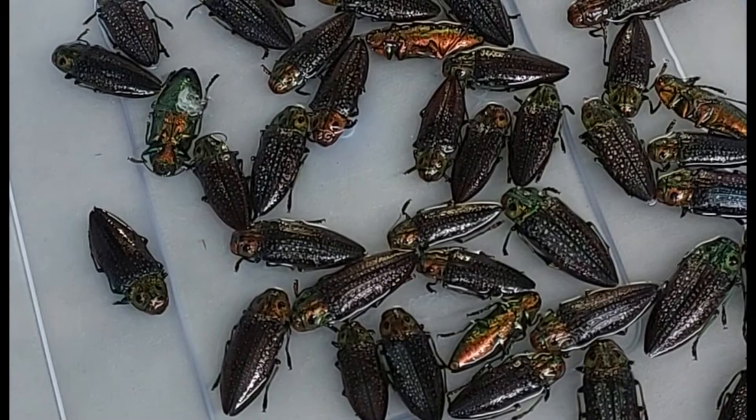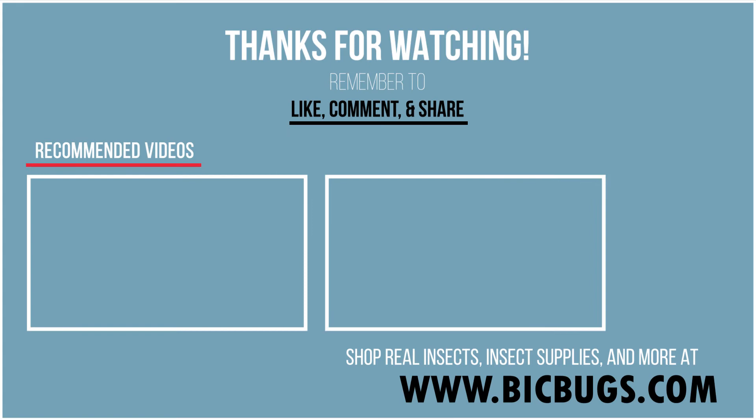You can leave the specimens in the alcohol almost indefinitely, but over time the alcohol will start to yellow and brown as pigment is released from the insects.